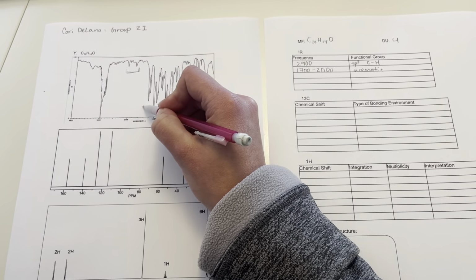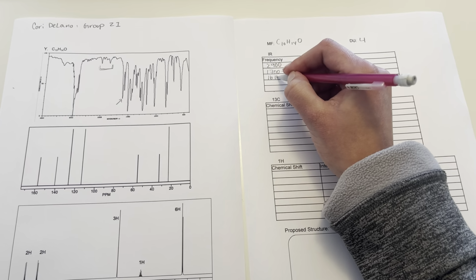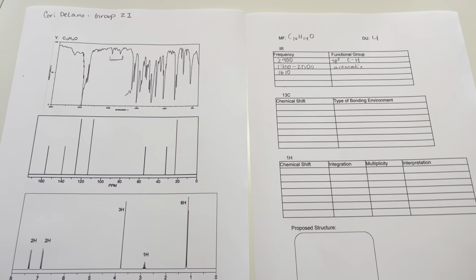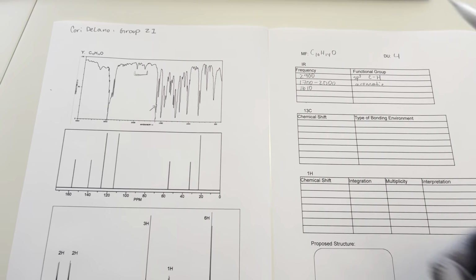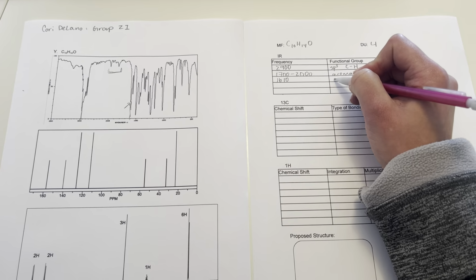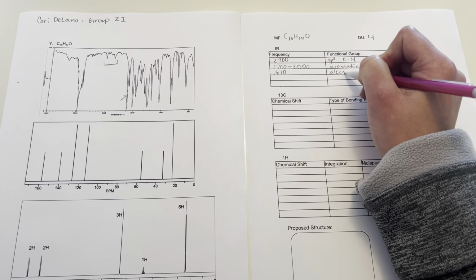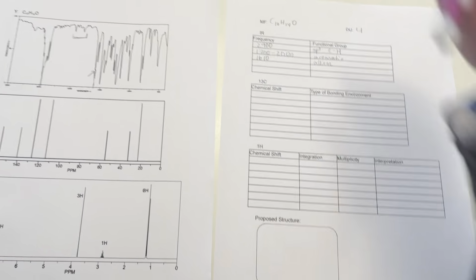Then right about here, at around 1610, we have some noise, and that's going to be an alkene, C to C double bond.